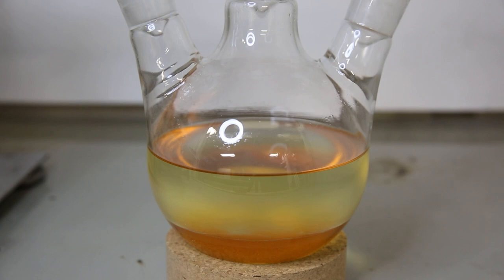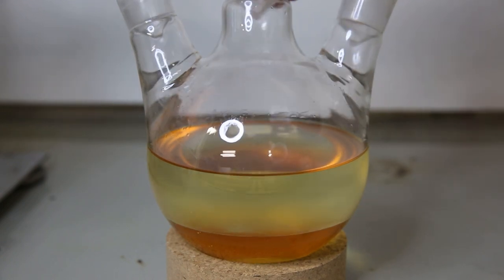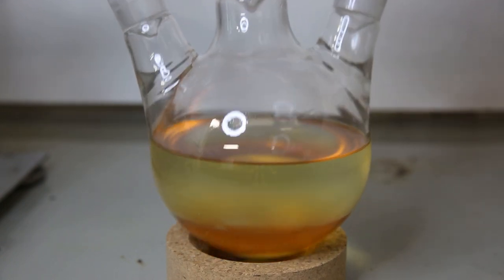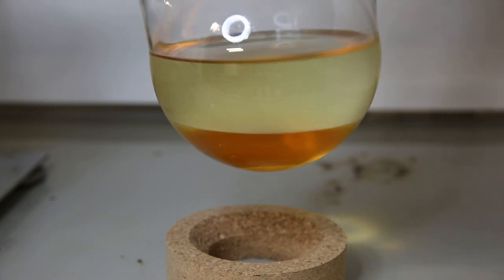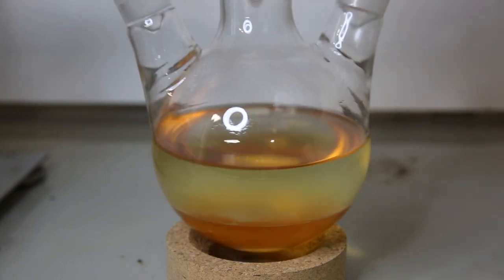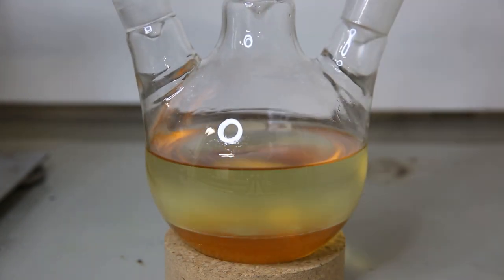After letting the flask cool down, the mixture has separated into two layers. The biodiesel layer is on top, and the glycerol layer is on the bottom. Since biodiesel is much less dense than glycerol, and it also produces around 3 times as much moles of biodiesel compared to glycerol, the biodiesel layer has a lot more volume and lays on top.